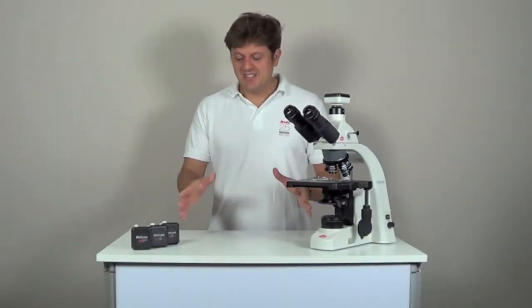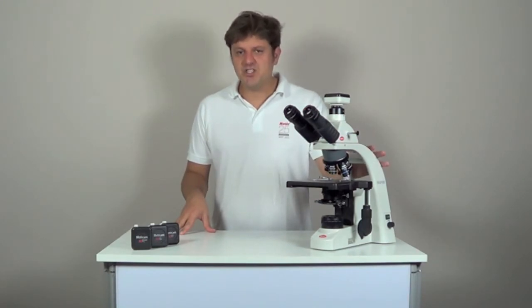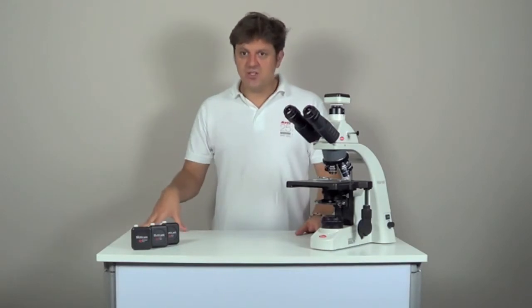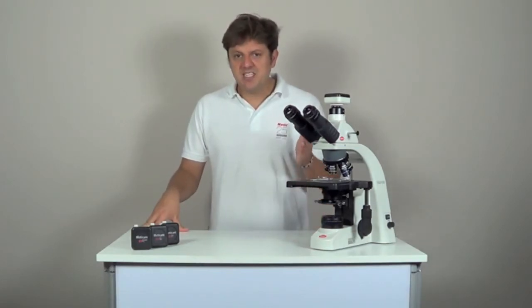Moticam standard live resolution cameras are introduction models in digital microscopy. They have a good quality sensor and are frequently used in education and small laboratories. Moticam 1 has a resolution of 800 by 600 pixels. It is a rather small image format, good for basic displaying of the image without need to zoom into details.